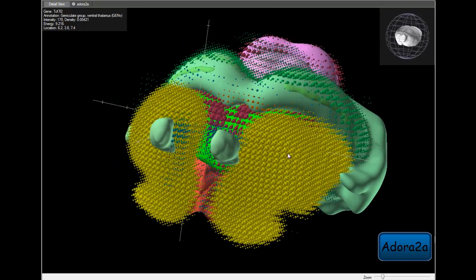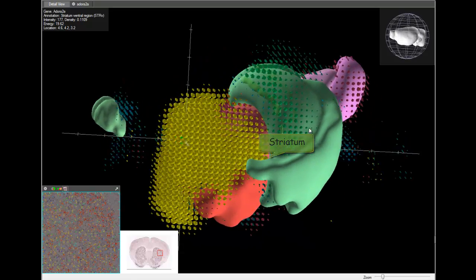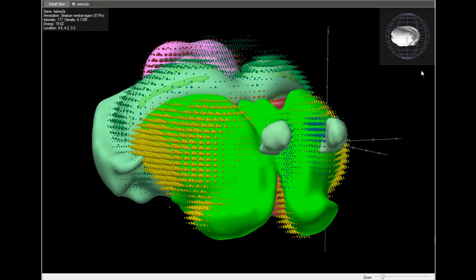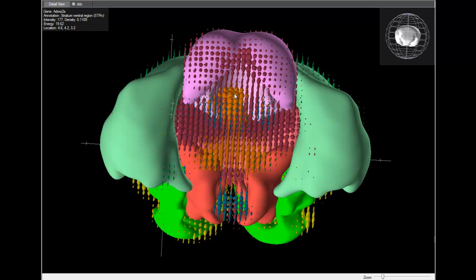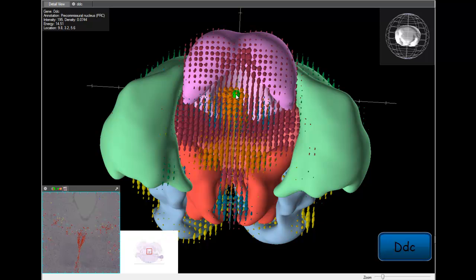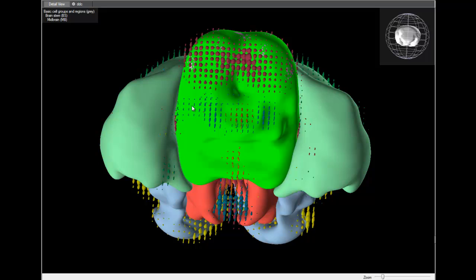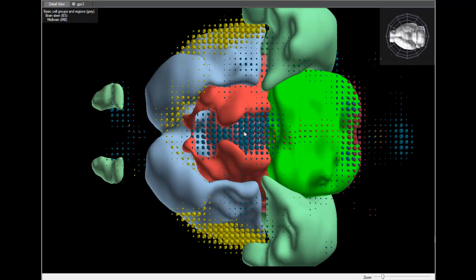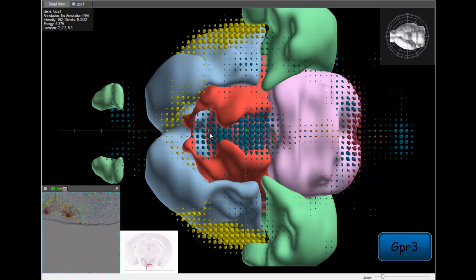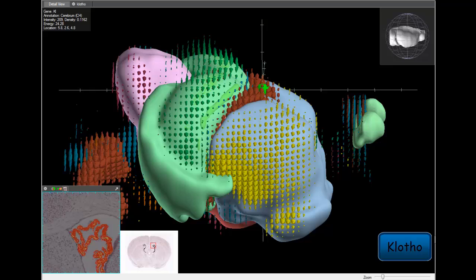ADORA2A is a magnificent marker for the striatum. DDC, or dopamine decarboxylase, is a marker for specific nuclei in the midbrain. GPR3 shows expression in the hypothalamus and CLOTHO brilliantly singles out the choroid plexus in the ventricle.